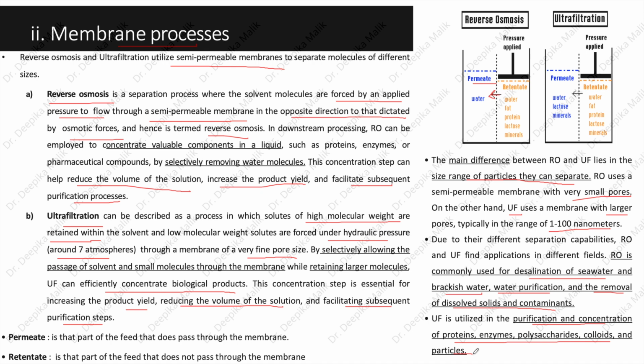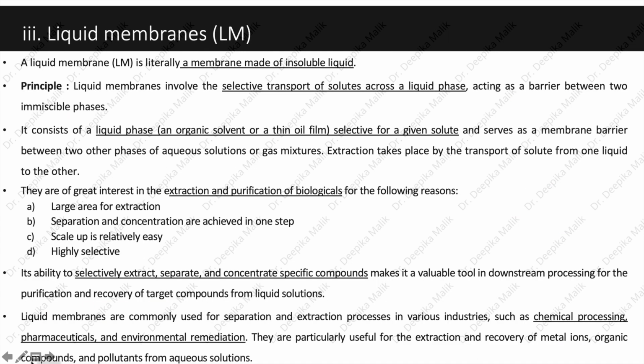Other purification methods include use of liquid membranes. A liquid membrane is literally a membrane made of insoluble liquid. Liquid membranes involve the selective transport of solute across a liquid phase, acting as a barrier between two immiscible phases.